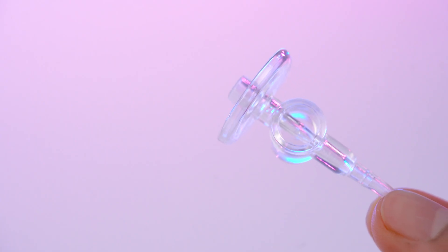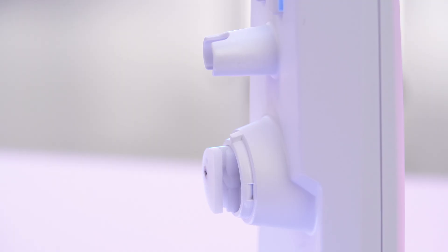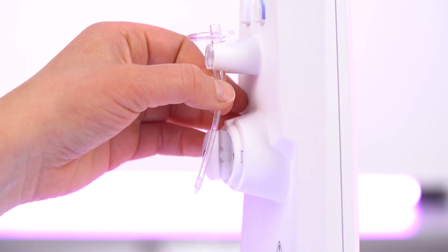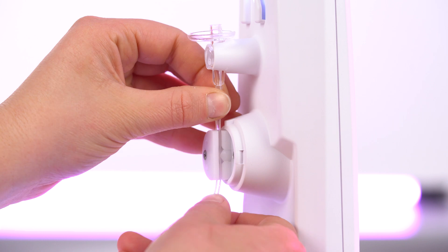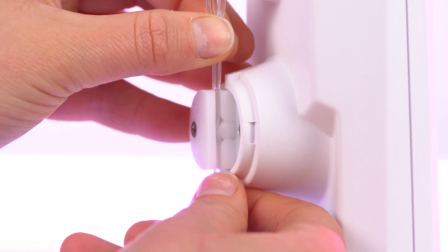If you look at the side profile of the nozzle set, you can see that one side is longer than the other. It's the long side you want to insert into the nozzle housing, so go ahead and do that. Now hold the tube at the top and bottom and slide it into place. You need to stretch the tubing downwards slightly to get it into position, just like this.